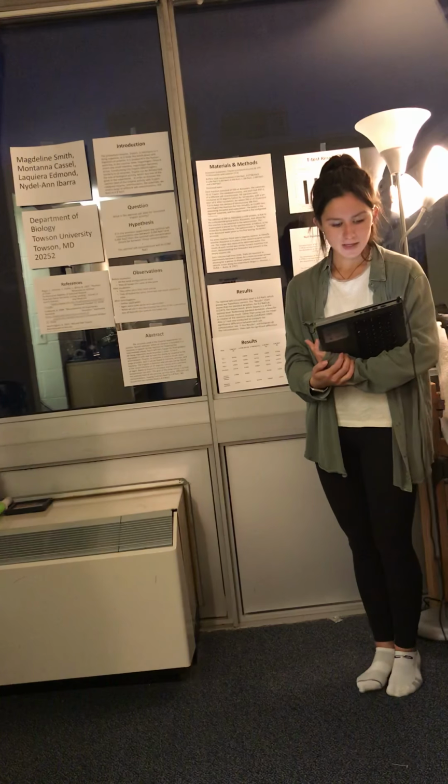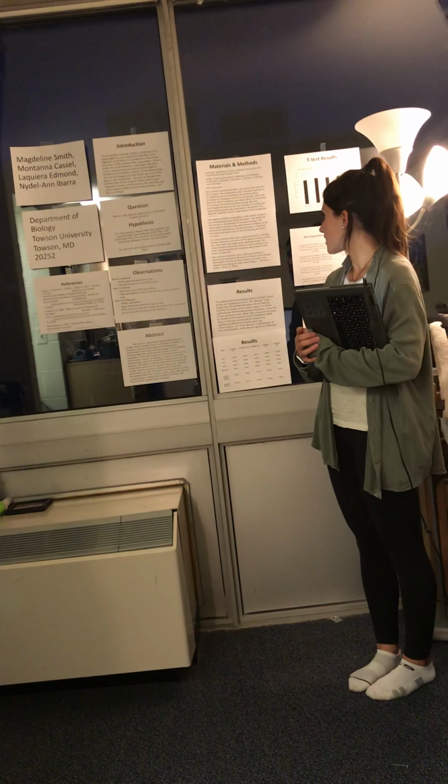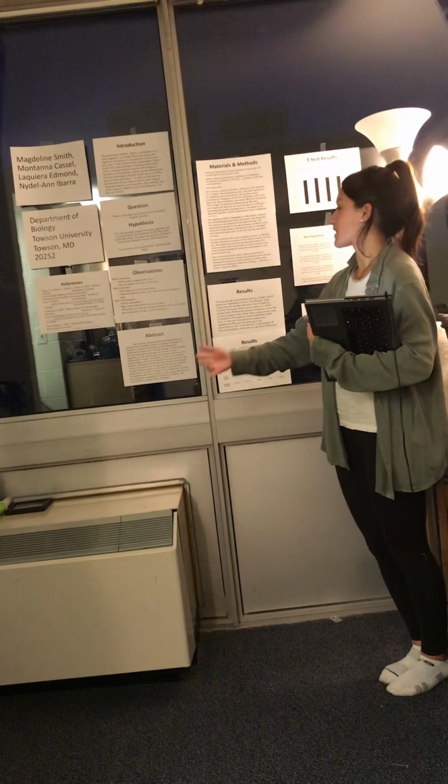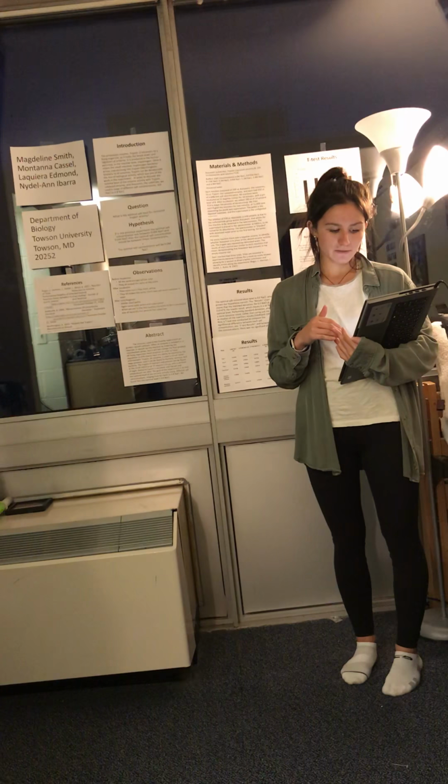And for every reaction, we did use a negative control because it allows us to identify whether or not azocasein is in place in the absence of the enzyme activity site. My apologies. The trypsin was replaced by the deionized water, and we found for each reaction that our results were similar to each reaction's trial mean, demonstrating that azocasein was present in the empty enzyme activity site.